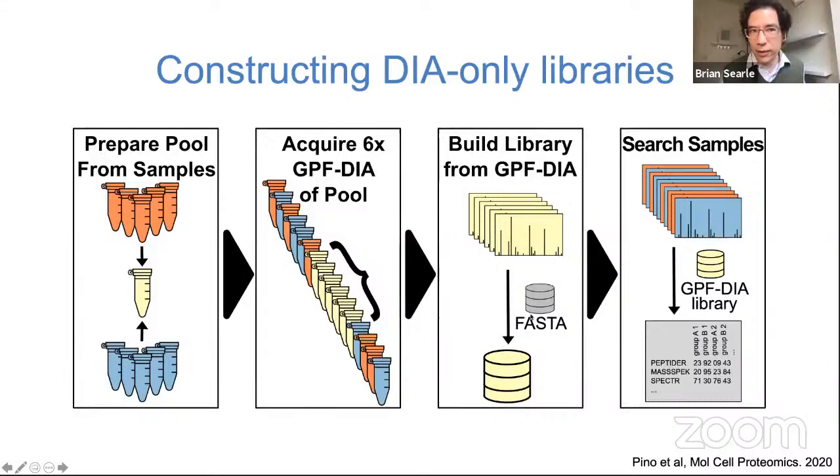We're searching that using the PROSIT predicted library, and then we're making here a library that is associated with all of the possible peptides that we can see in this sample. So now we've identified all the peptides that we're confident in seeing in either the orange or the blue samples. And now we could just take our quantitative samples and then look those guys up very accurately.